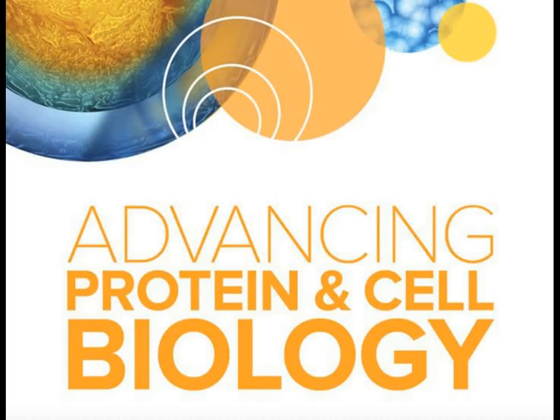They have a flat bottom, but they have a conical well, so that flat part is very narrow. So in both cases, because we have a large field of view camera, we are able to cover all spheroids in any location of the well at 10x magnification. For 20x magnification, it's also possible in an automated fashion when we're using a Corning plate, whose U-shape allows the spheroid to be centered in a well, which allows us to capture the entire object without splitting.